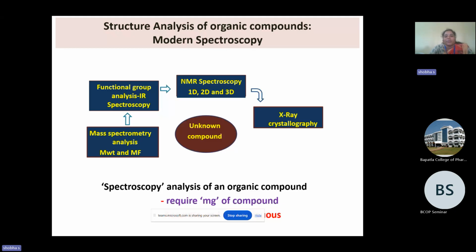Especially, we are going to use HMBC, HSQC, and also, finally, the important one is X-ray crystallography, where we are going to completely determine the lattice of the structure by means of X-ray crystallography. So we start with the mass, and we are also going to end with the mass. That is the only thing we are going to generally perform.